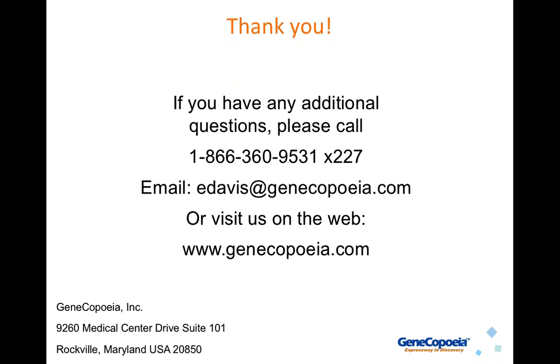Next question. Is it possible to use this method to knock out pro-survival genes or genes involved in cell proliferation? Yes, it's possible, but if you're knocking out an essential gene, that could be difficult. You might only get single allele modification clones, but you might want to consider using a conditional knockout or some kind of inducible knockout.